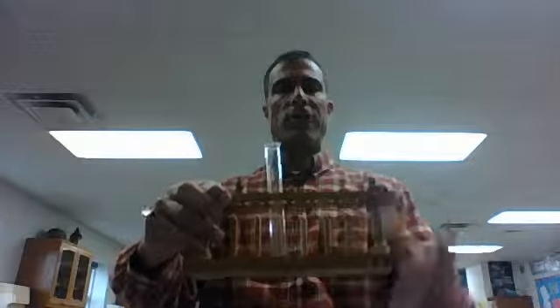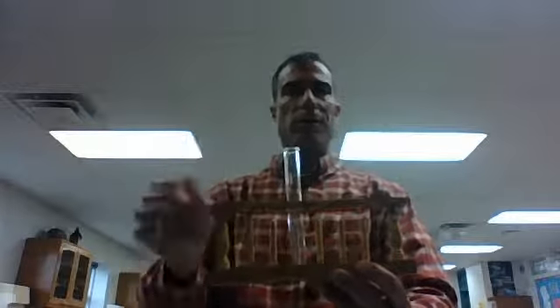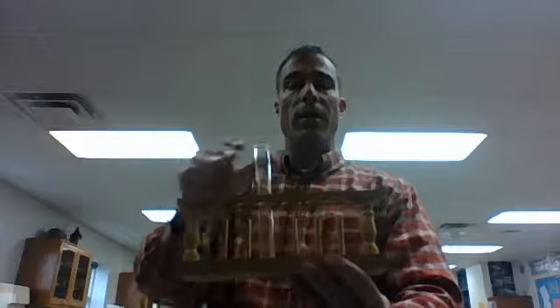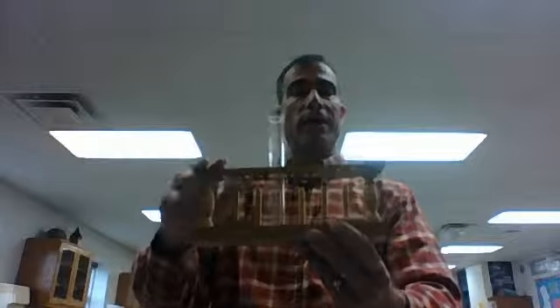The next item is a test tube rack. Test tubes are placed in the test tube rack while you're working, sitting at your table or your lab station, just like this, and you can pour things in. You may need to pick up the test tube as needed, but generally you want to leave them sitting so there's no way they're going to break. When you're carrying test tube racks with test tubes in them, they can slide out like you can see right here, so you need to be careful. But again, the wooden rack is called a test tube rack.